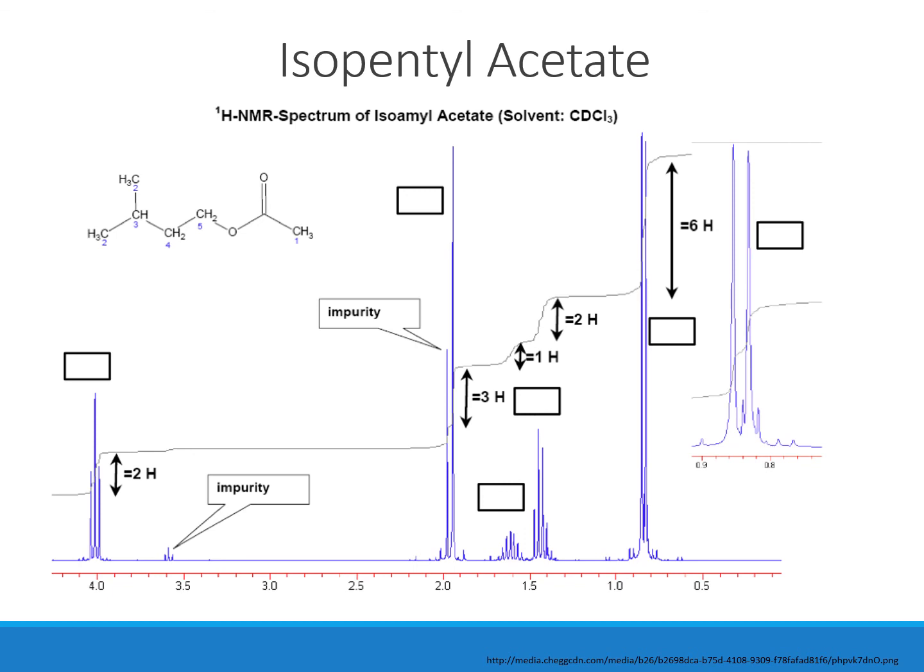Actually, this is what makes research very difficult, because when you do research, you're not going to clearly find the spectrum we are talking about. Even for benzaldehyde itself, you might not find 4 clear peaks like that, because as far as you are doing research, you may have impurities. It's impossible to be completely isolated from any impurities.